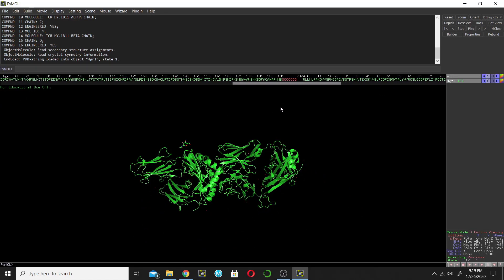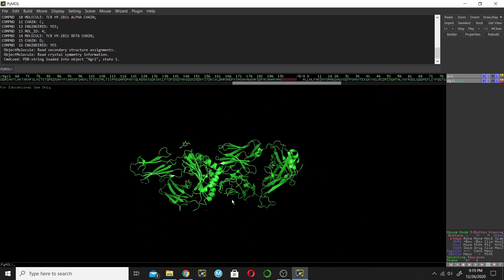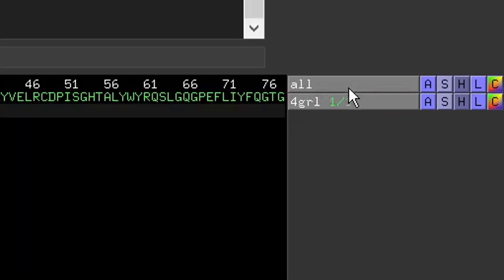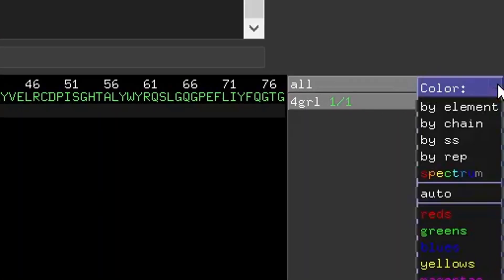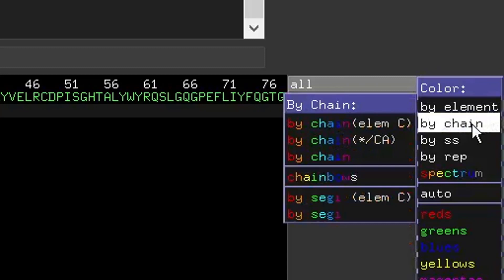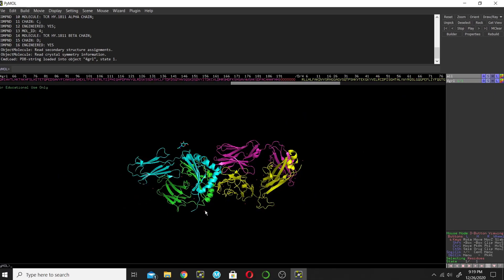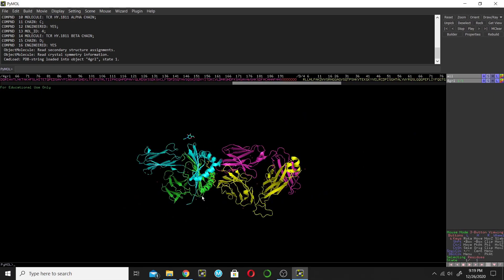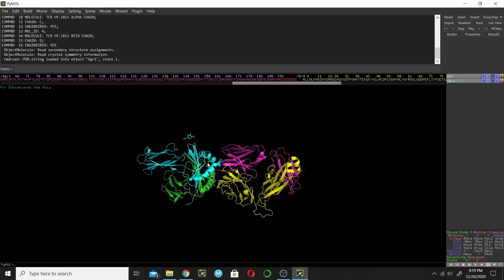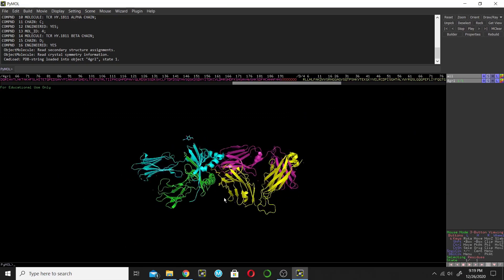The second way to find the chains is by coloring them. Go next to 'All' and click on C, then color by chain. You can count four distinct colors, so there are four chains.